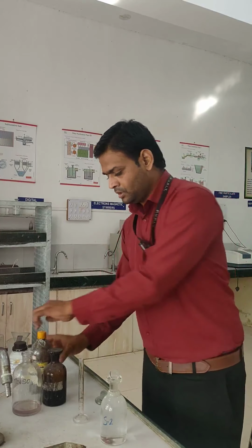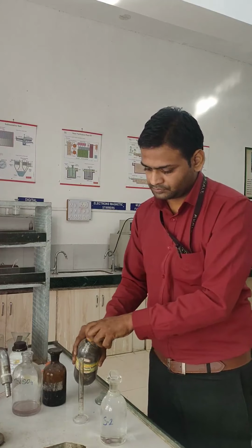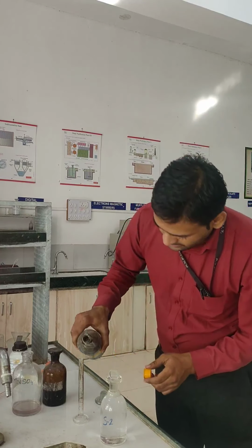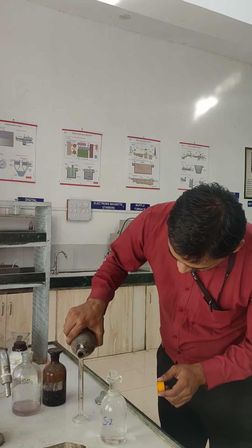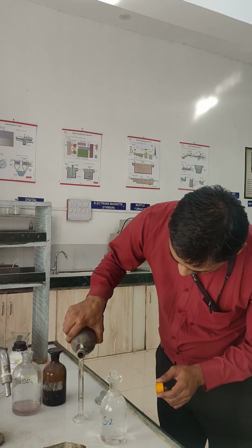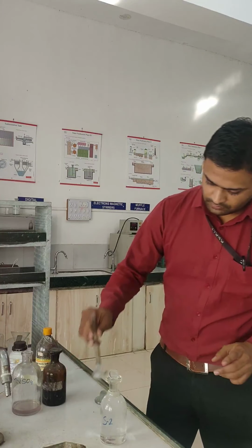Then we are adding 2 ml of alkali iodide azide to the water sample.